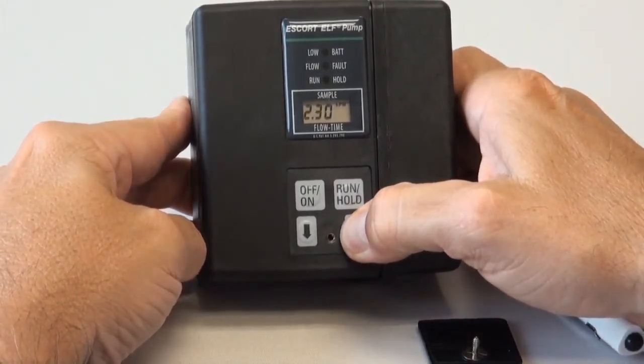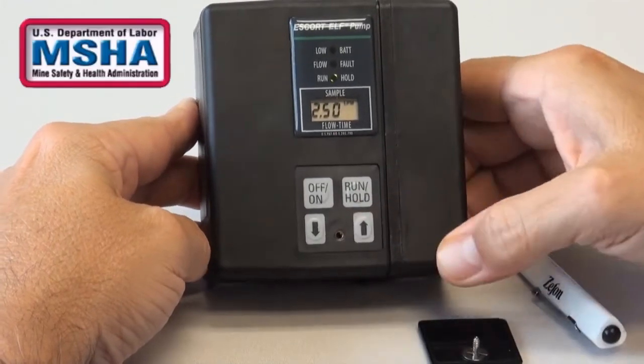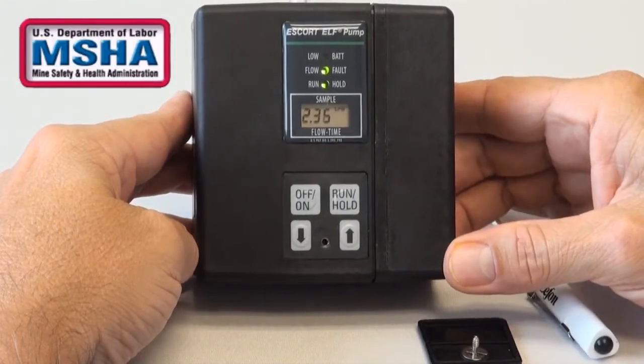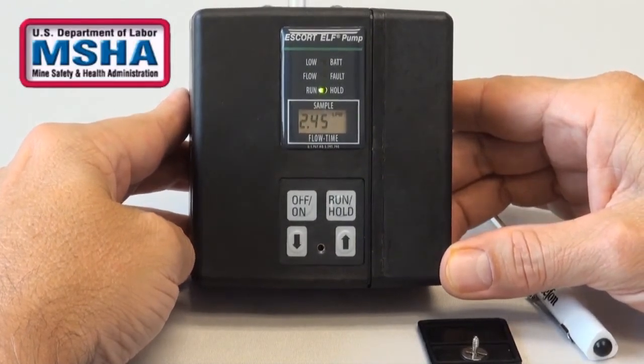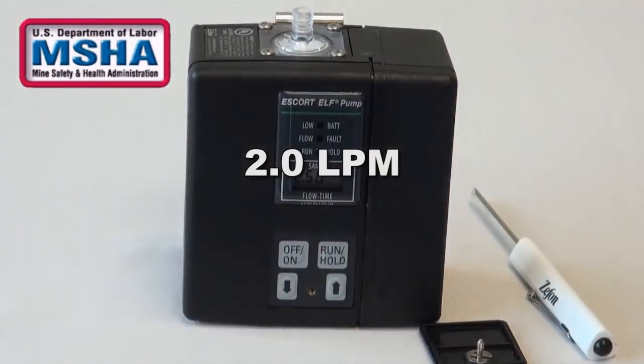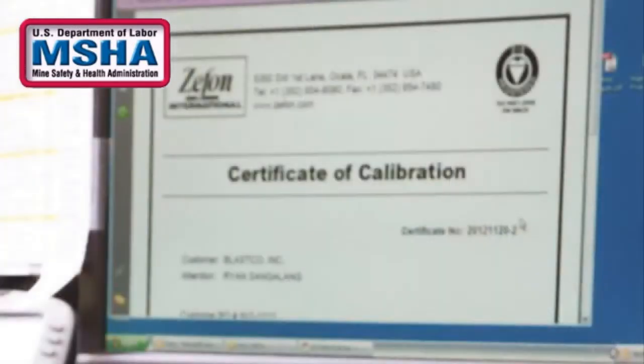If you are using the Escort Elf for the MSHA, or Mine Safety and Health Administration's underground coal mine dust sampling program, you will use a setting of 2.0 liters per minute. All other procedures are the same. However, MSHA compliance requires calibration to be performed by a certified MSHA technician such as Zefon International.